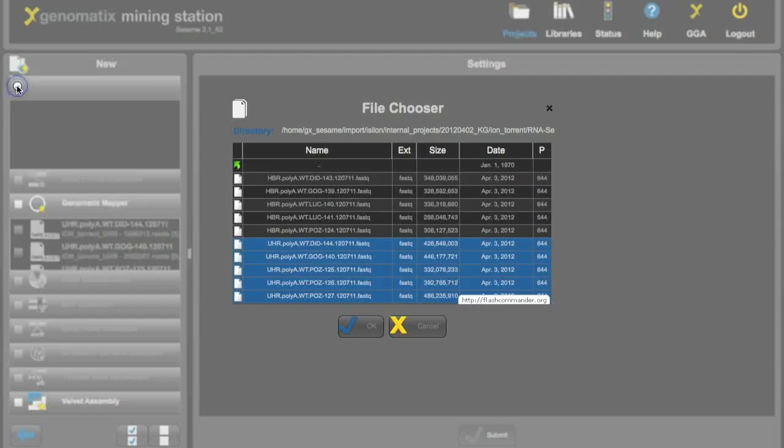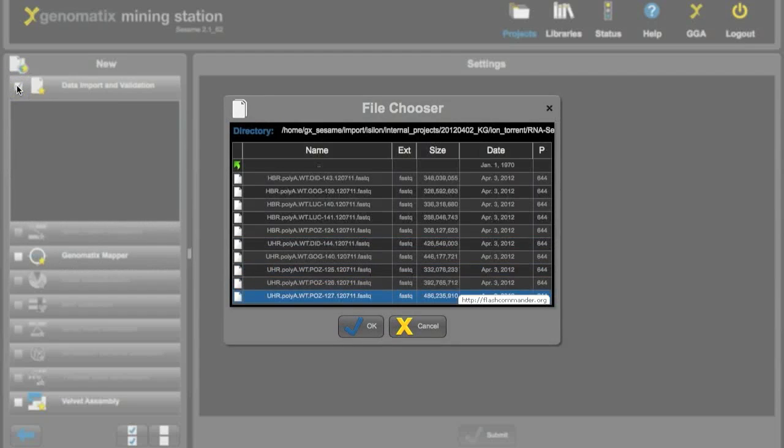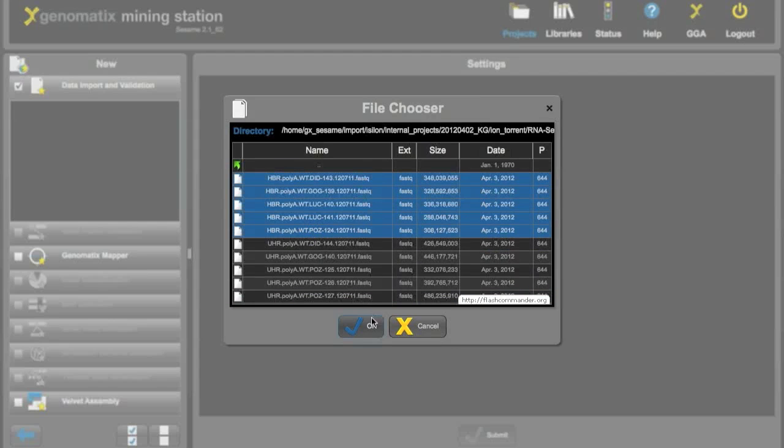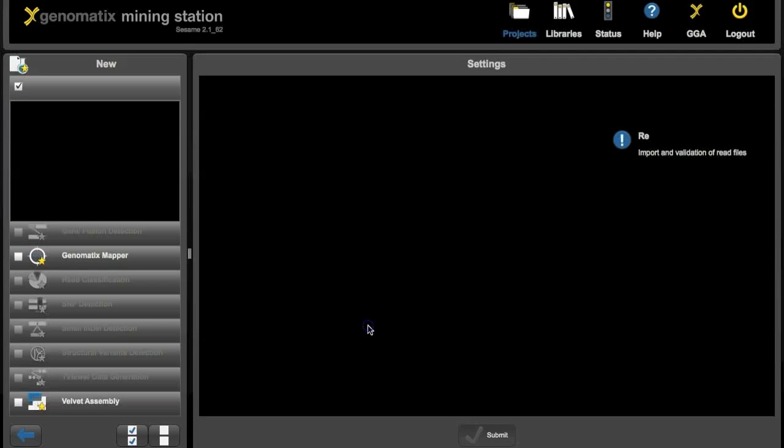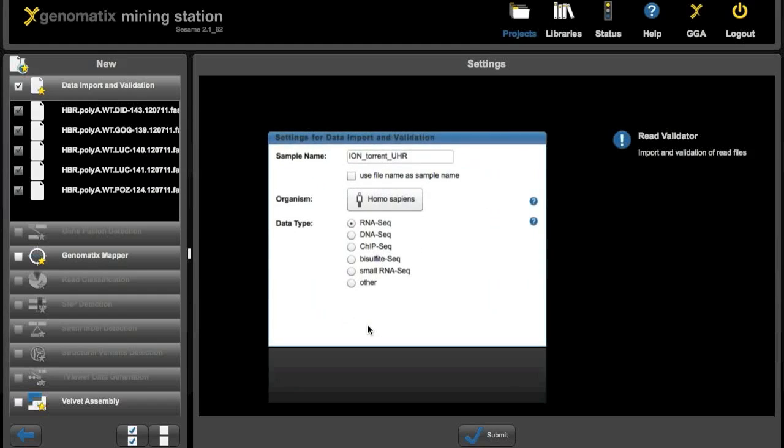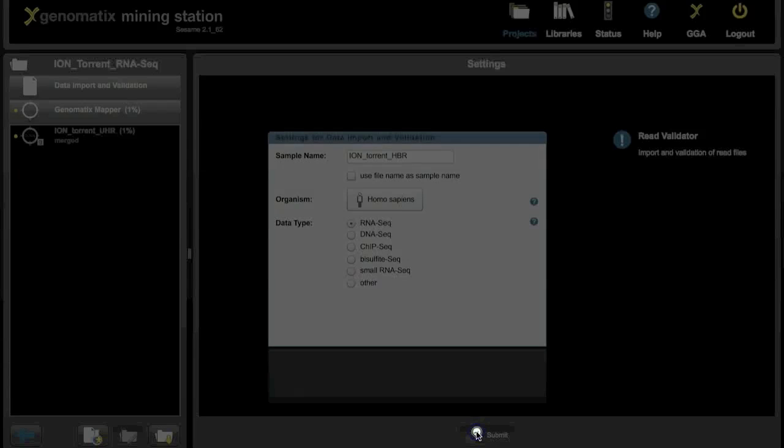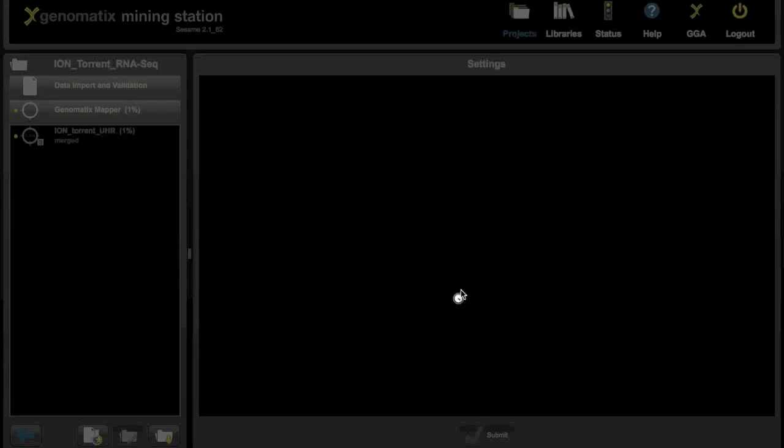So we click on the data import again. And as you can see the file chooser is just where we left it. So we can easily find the five files for the human brain reference. Also for the sample parameters, we can just do a small correction here to call it Ion Torrent HBR.